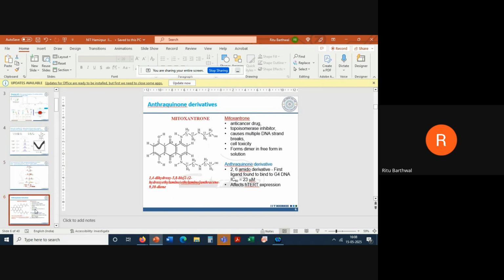So coming back straight to applications, almost the minimum that one needs for structural analysis, and the most common thing one uses, is characterization: number one chemical shift, number two J value, and number three NOE value. And we try to get the structure of the molecule with the help of that.